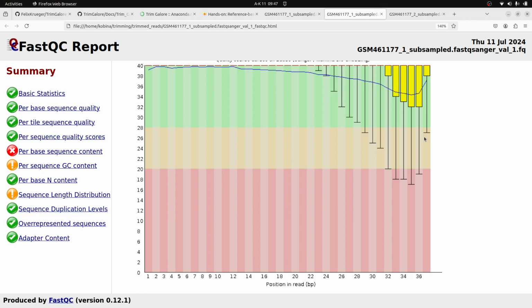So if you run your QC, FastQC, and you see that the low quality ends are there, you find a presence of reads with low quality ends, then one of the strategies is to improve your reads by trimming those low quality ends to remove those bases. Okay, and then you can proceed. So you need to decide which situation is appropriate, or you can consult your bioinformatician, and they will guide you to do the appropriate activity. Okay, so this is for the Trim Galore tutorial.